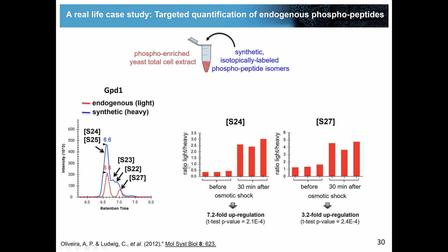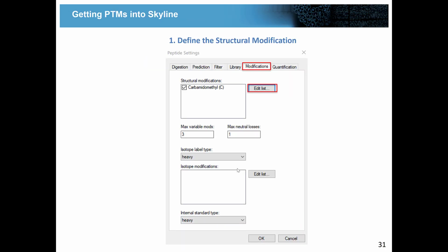And we then did this also in this publication here in MSB from 2012, already a long time ago. There we then did some follow-up experiments where we mutated these phosphosites and could then also once more validate, with these yeast mutants, the function and the importance of these specific phosphosites.